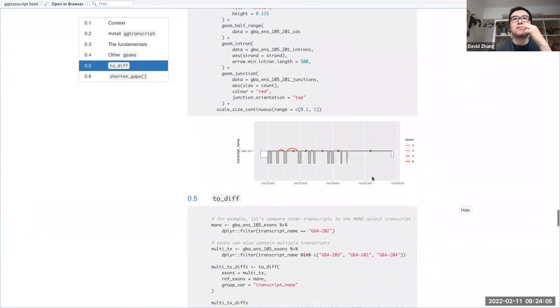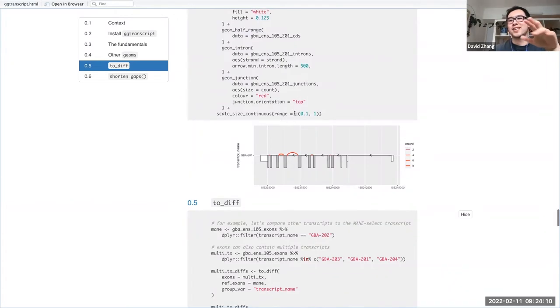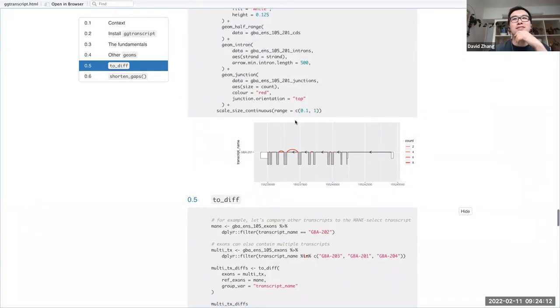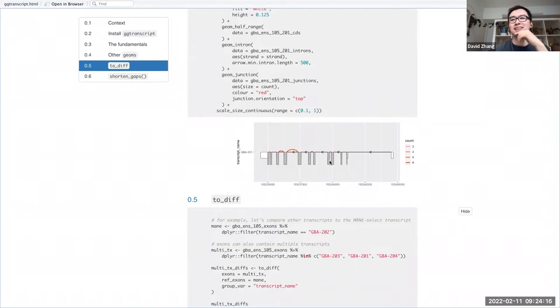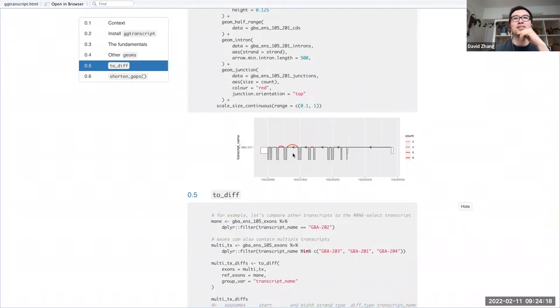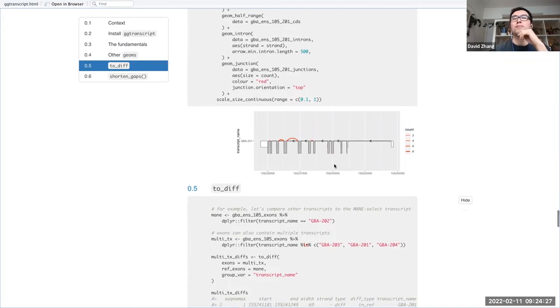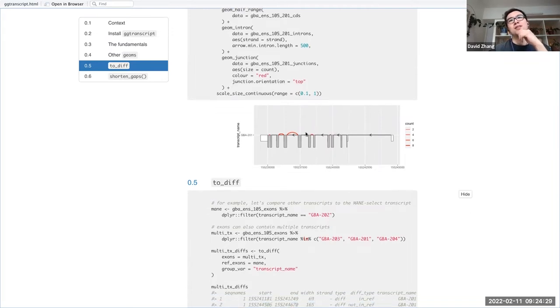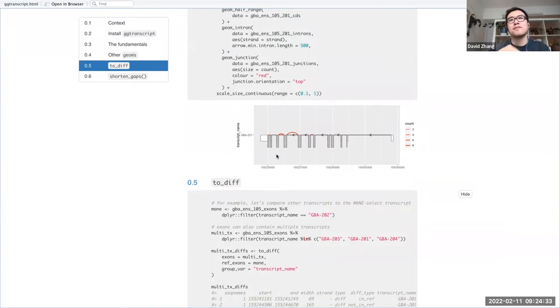Finally, this is a plot we thought about when introducing geom_half_range. Now that I've plotted it in reality I'm not sure it works that well, but you can see the potential — you can play around with curvature, which is another parameter for geom_junction. You can plot the transcript annotation on the bottom and keep all that information because it's vertically symmetrical, whilst plotting the junctions on top.